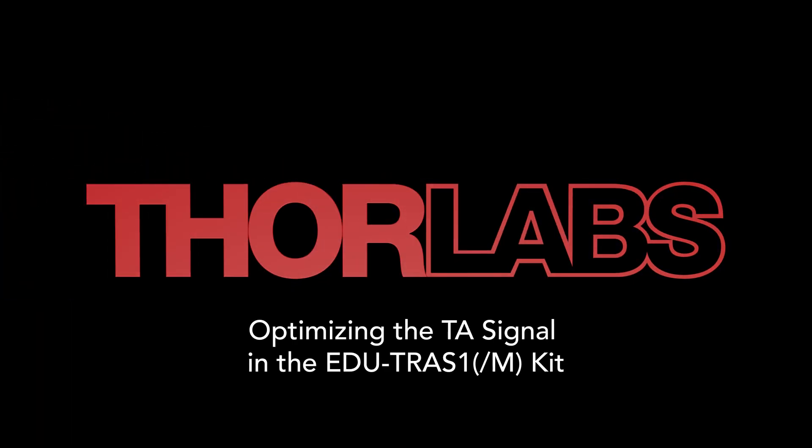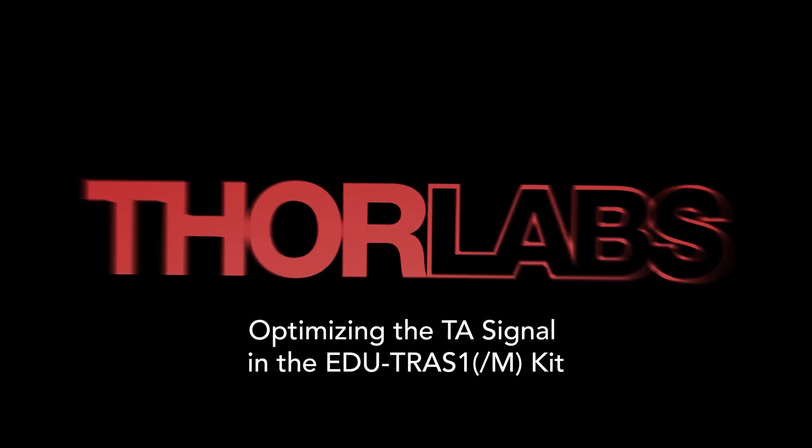Hello and welcome to Thorlabs. This video explains how to find and optimize the transient absorption signal after the setup has been pre-aligned.